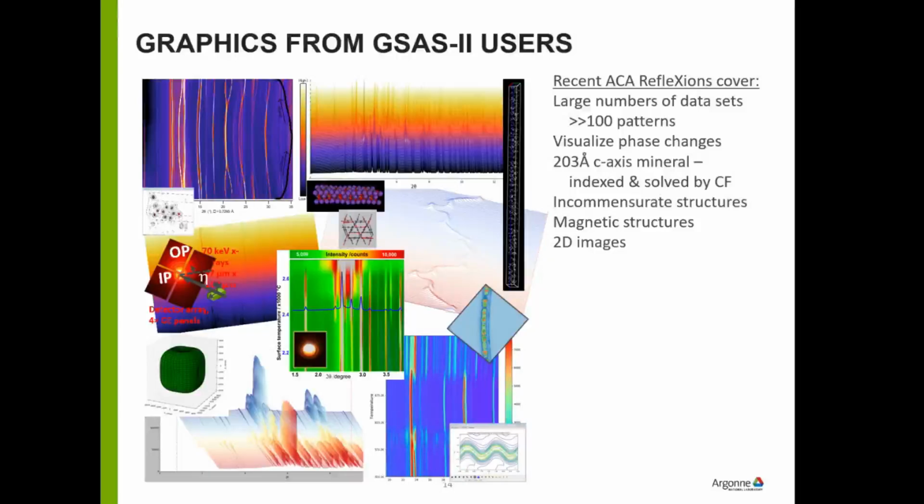And it's a so-called merohedral twinning in which the two twin members exactly overlap in the diffraction pattern. So it looks centrosymmetric, but it's not. Anyway, that's the story there.